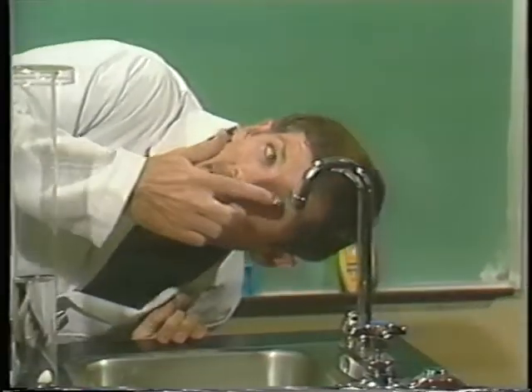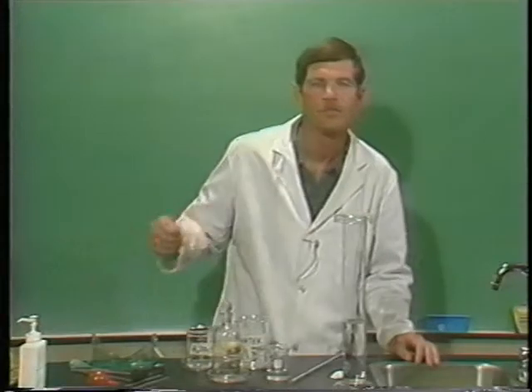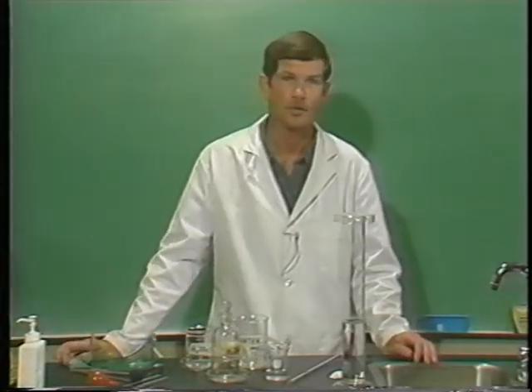If you ever happen to get acid in your eye, you want to definitely get to the nearest water supply and rinse the eye out. Hold your eye under a water faucet if necessary, and rinse it from the inside out, never from the outside in, or it could wash acid into your other eye. This is true for other chemicals too.